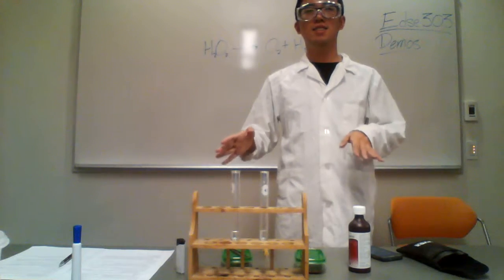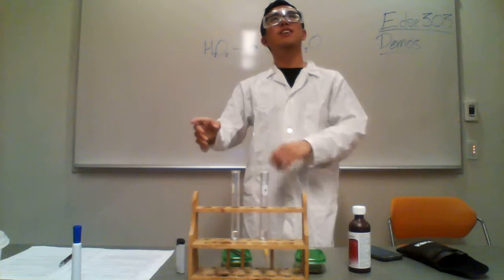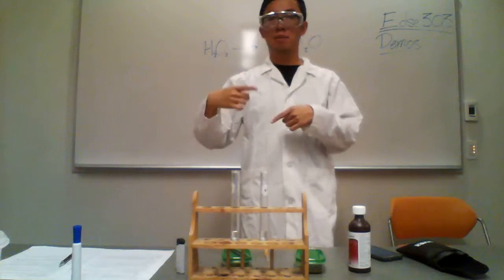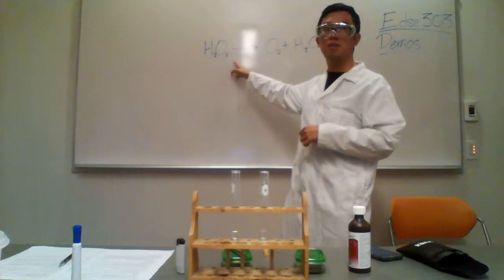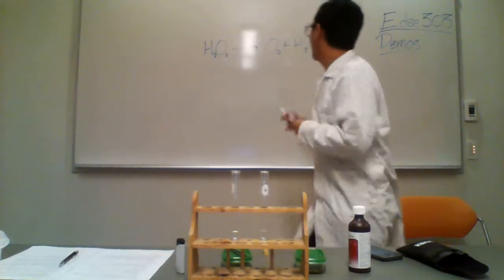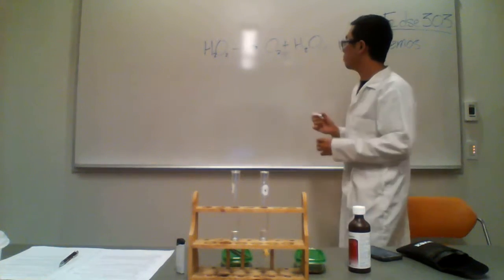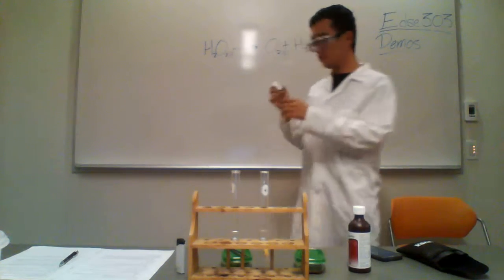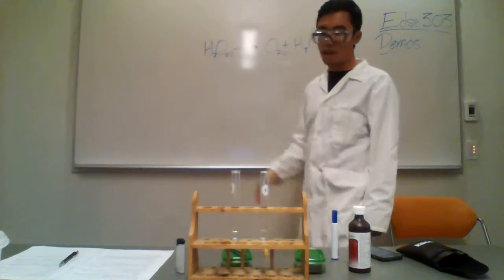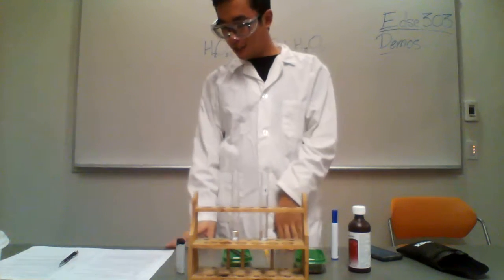Do you guys know what a catalyst is? Anyone? No? So a catalyst is basically, in our sense, a protein catalyst that will speed up a reaction. So it's going to speed up this reaction from H2O2 to oxygen gas and liquid water. Let's do a little chemistry here. The catalyst is going to speed up this whole process, and it'll be a reaction.